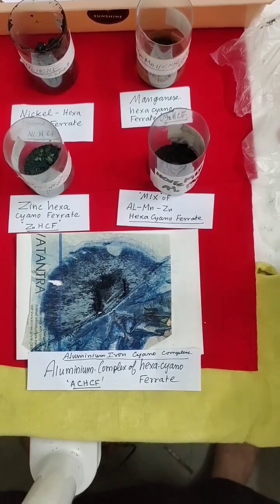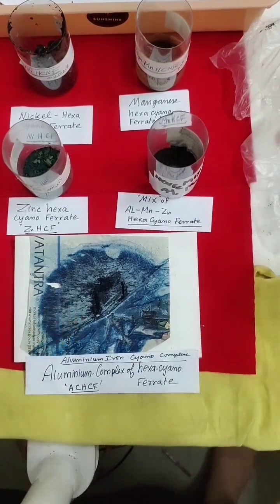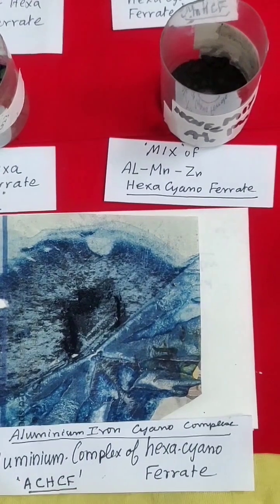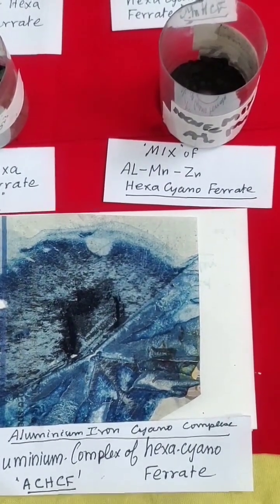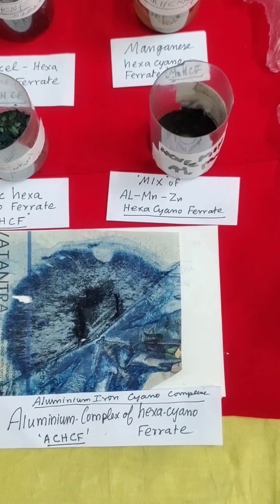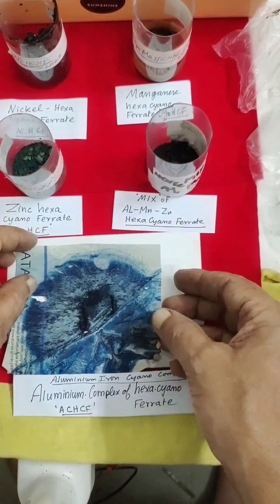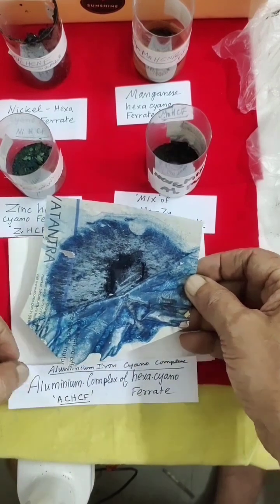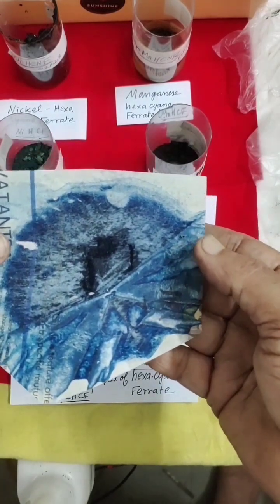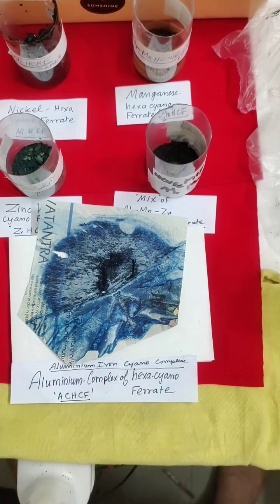This is the quantity I am able to get — you can see it here. This is what I got; this is called aluminum iron cyano complex. After filtering and drying in a hot air oven, you can see only small quantities, because from 2 grams of starting material we are only able to get this much complex. This is aluminum iron cyano complex.